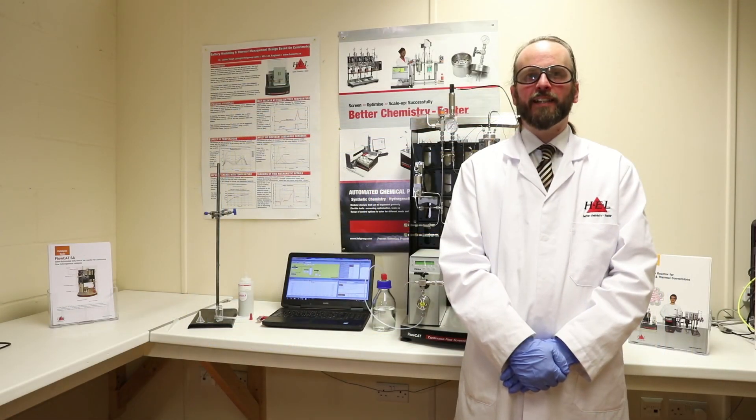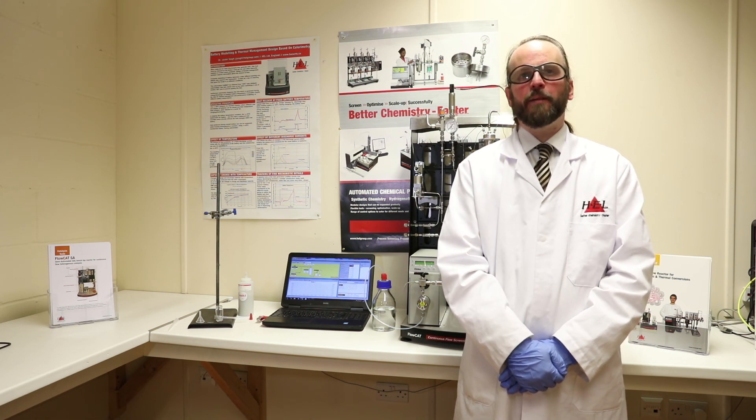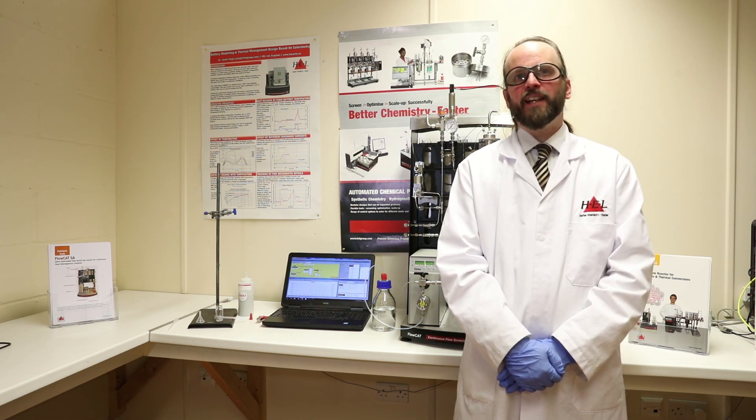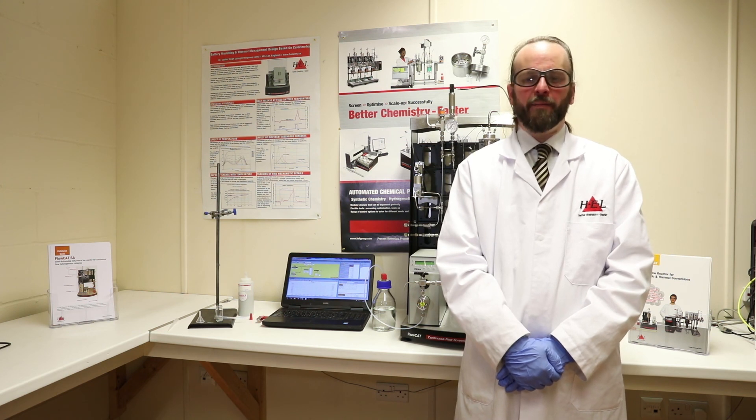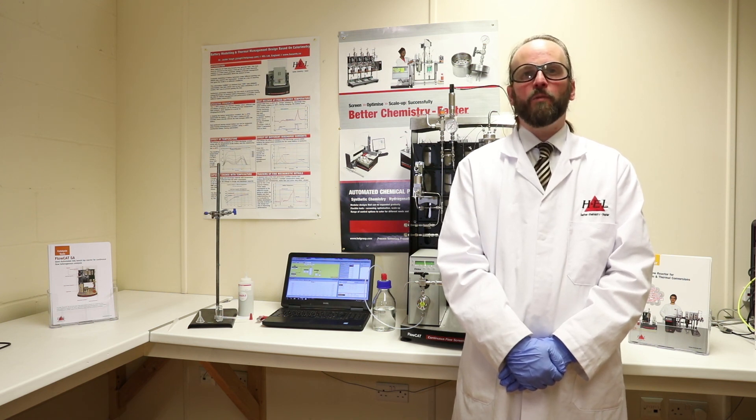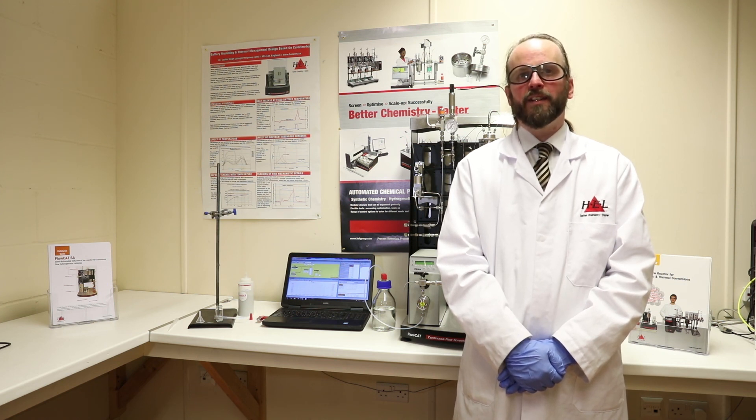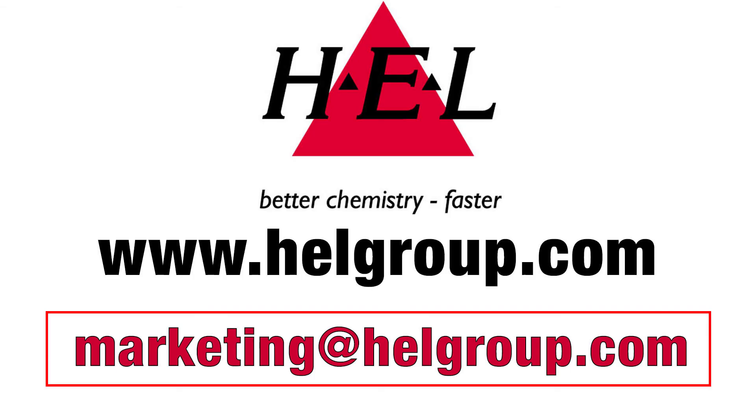So this is our Flowcat system. It's a benchtop system that can be easily used to produce kilograms per day of material. It's flexible and it's simple to use for all chemists and most of all it's safe. For more information on this or any of our other products, please visit our website at www.helgroup.com or email us at the address shown at the end of the video.